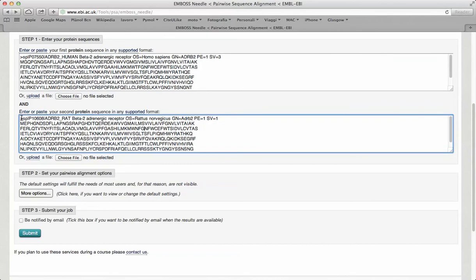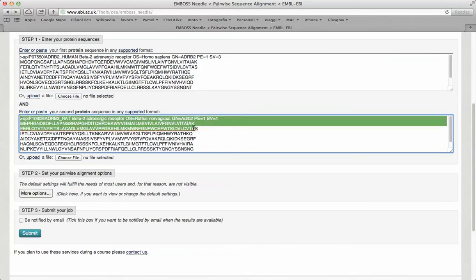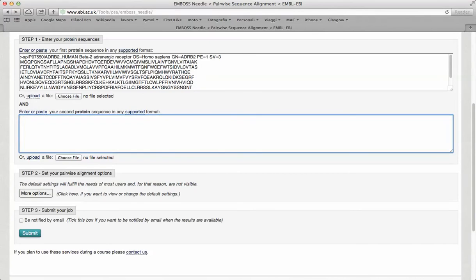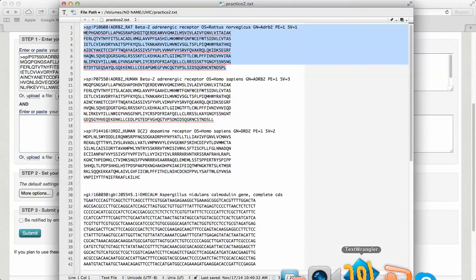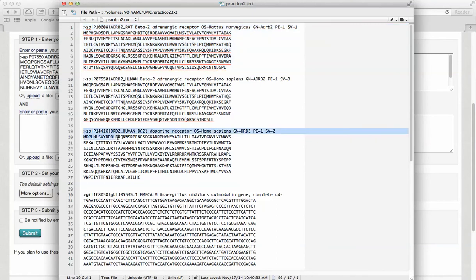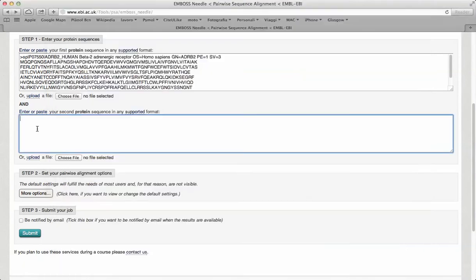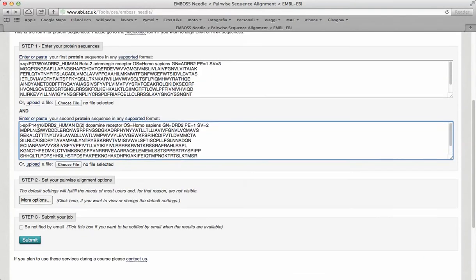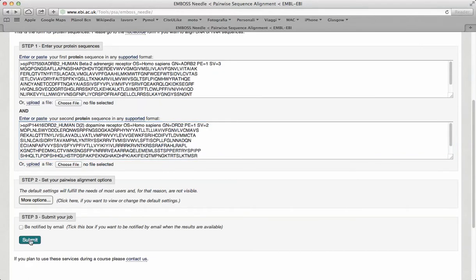Now, we are going to substitute this receptor for a member of the same family, but more distantly related. That is the case of the dopamine receptor of humans. And submit the alignment.